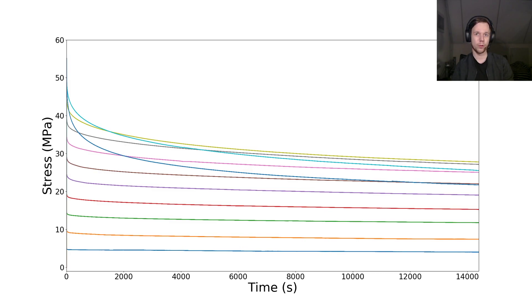Going further to 55 MPa, this effect gets even worse. As you can see now that dips below the 50 MPa sample quite quickly, and then also through the 40 and 45 and 35 MPa samples.